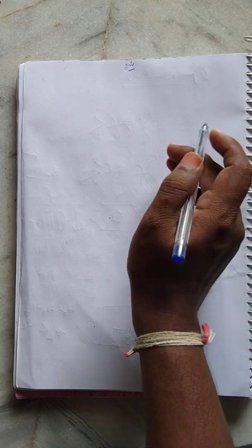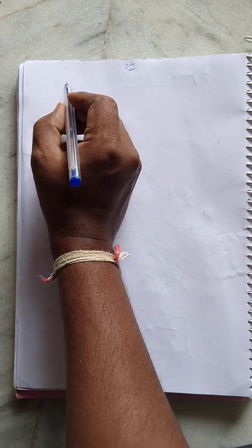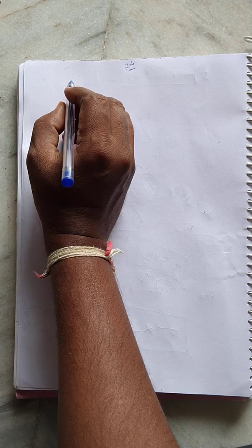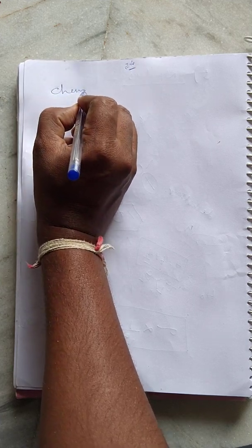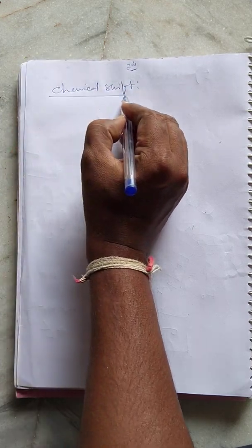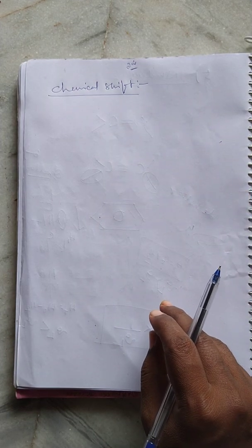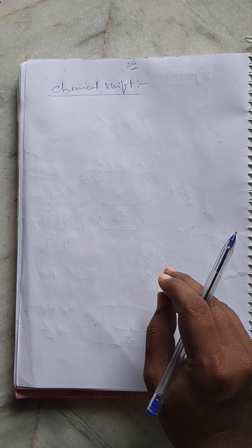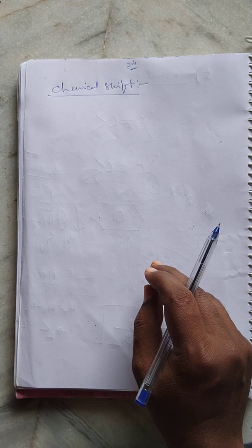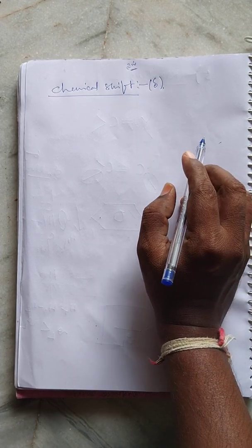And in this video we are going to discuss one of the important vocabulary terms in NMR spectroscopy. It is chemical shift. So chemical shift is the value used to measure the NMR graph. These are the values you can find in the NMR graph, and generally it is denoted by the delta value, right?